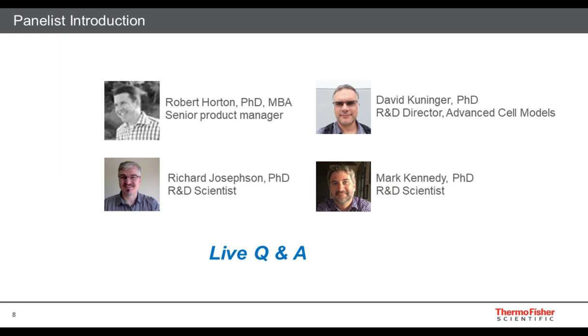Great. Okay. And then I'm going to combine two different questions here together. A couple of questions around genome editing of your organoid models as well as gene silencing, and just curious on your experiences in editing cells that are eventually used for 3D models, or even editing the 3D models themselves, or if you have any guidance or advice in that arena. Yeah, I don't think that editing the 3D models themselves is that common an approach, because you end up editing the cells on the outside and not the inside.